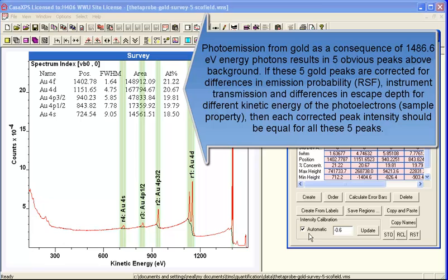The transmission is indicated by this tick box here that says automatic, which means that the transmission is involved in this quantification table. And we have an escape depth of minus 0.6.